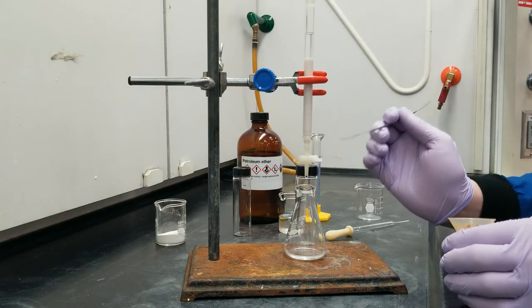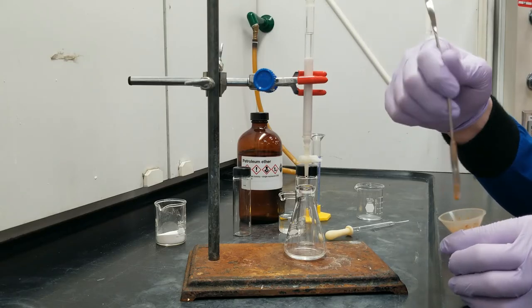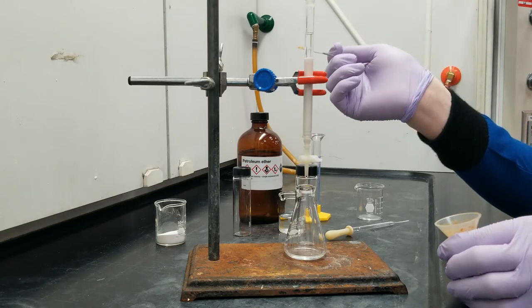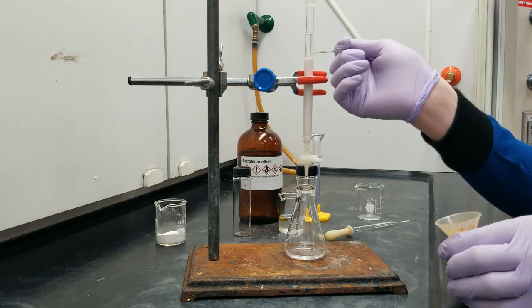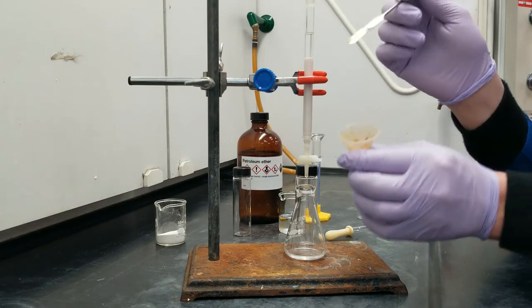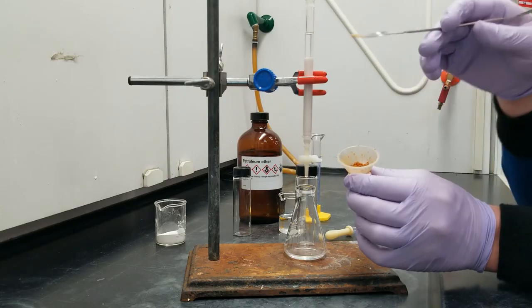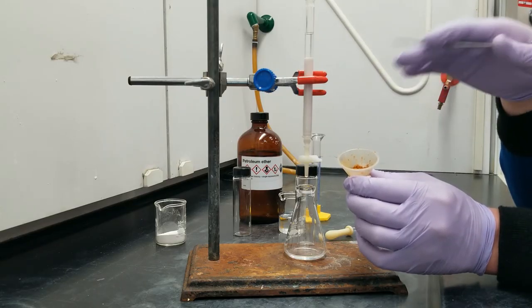Turn my stopcock to stop the flow because I'm satisfied with this amount of petroleum ether on top to go ahead and start adding my compound. By minimizing the amount of petroleum ether above here, I'm going to minimize the dilution of my sample, and that will give me nice tight bands of compound running down my column.